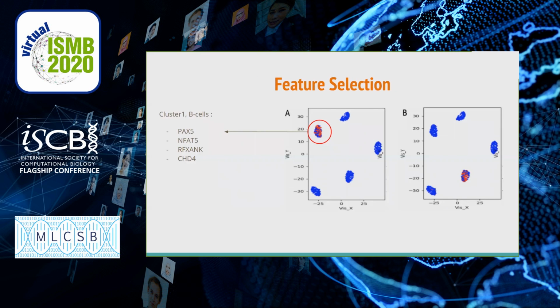This is a COMET output visualization. Dots are the cells, blue color indicates the lack of the 4 marker genes. Red color represents the presence of the 4 marker genes for each cluster.